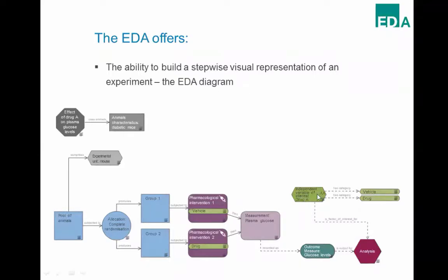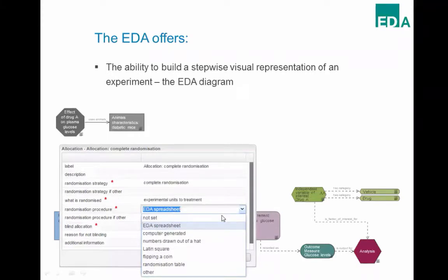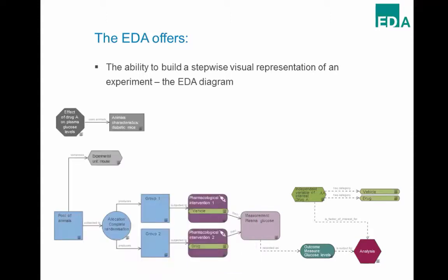Each colourful element is called a node, and each node contains more information. In the allocation node properties, for example, you can indicate your randomisation strategy — such as complete randomisation — and your randomisation procedure, whether by flipping a coin or using a spreadsheet generated from the EDA. The diagrams are far more explicit than text descriptions, since inside each node you find details about that specific step in the experiment.